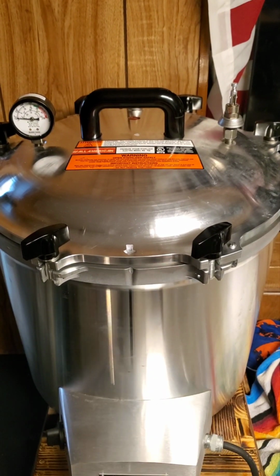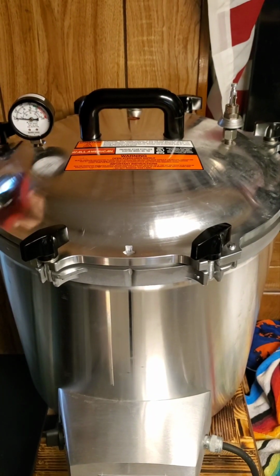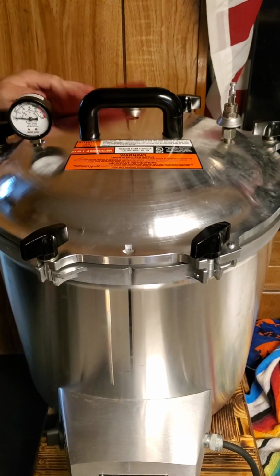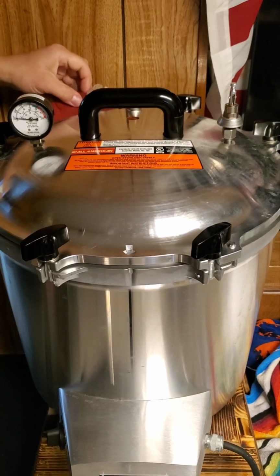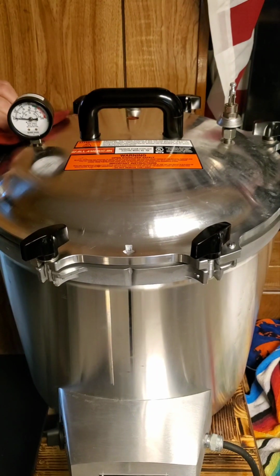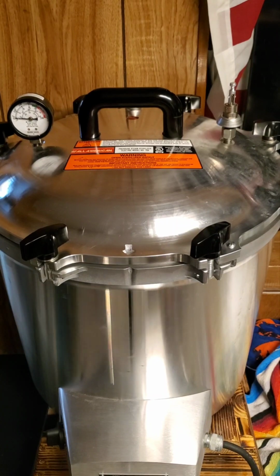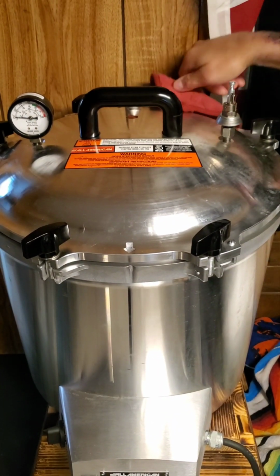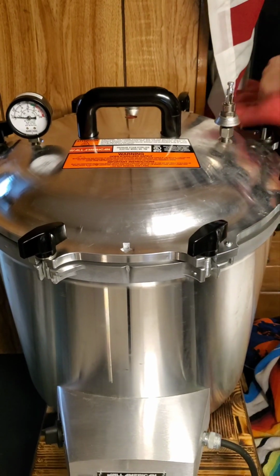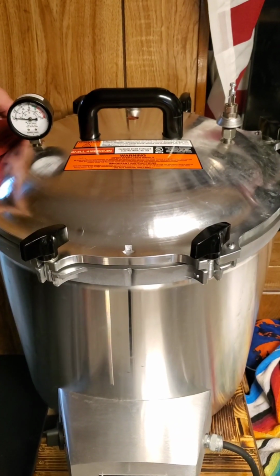All right, so I'll show you how I take it out. This is what I've been doing so far. It's working good. Loosen everything up, one at a time, starting with the end away from me, just in case. Using these things here, it's wicked hot. You can wait for it to cool down, but according to the owner's manual, it's going to be harder to take off if you let it cool. So, using that, loosen everything, get it all.